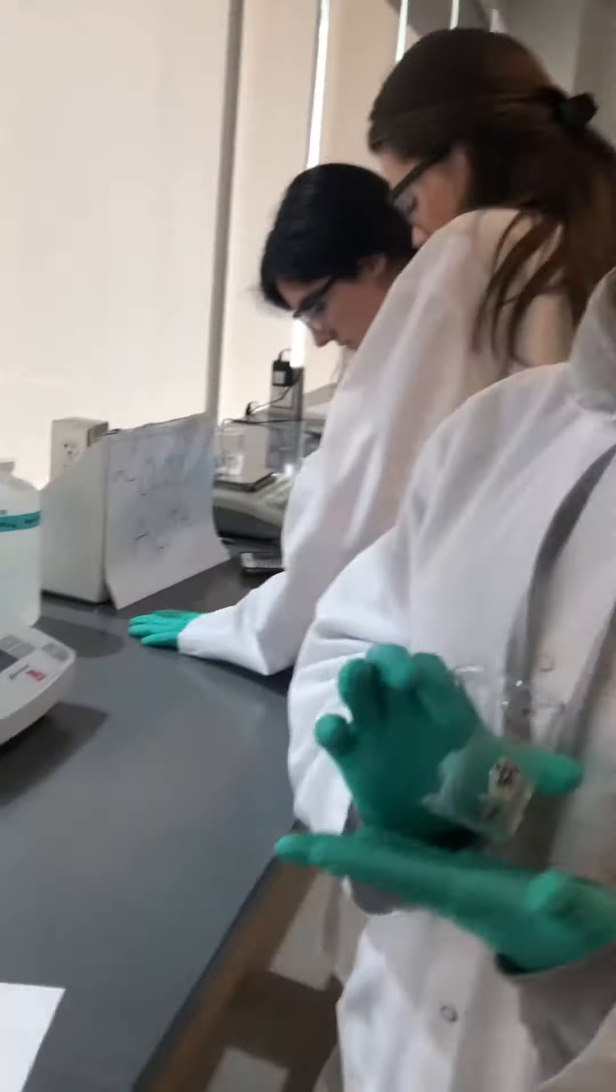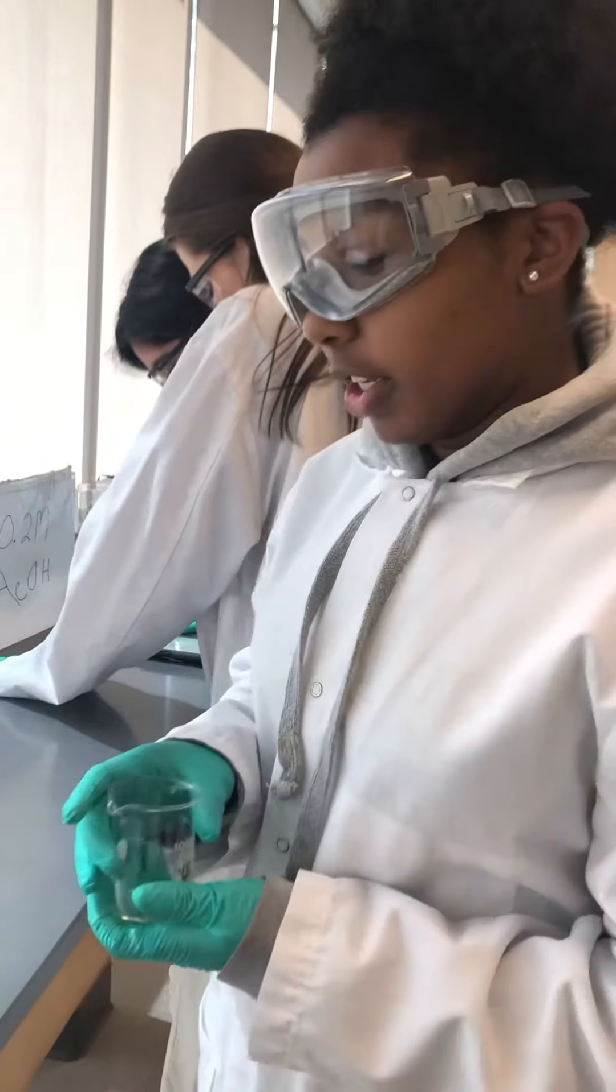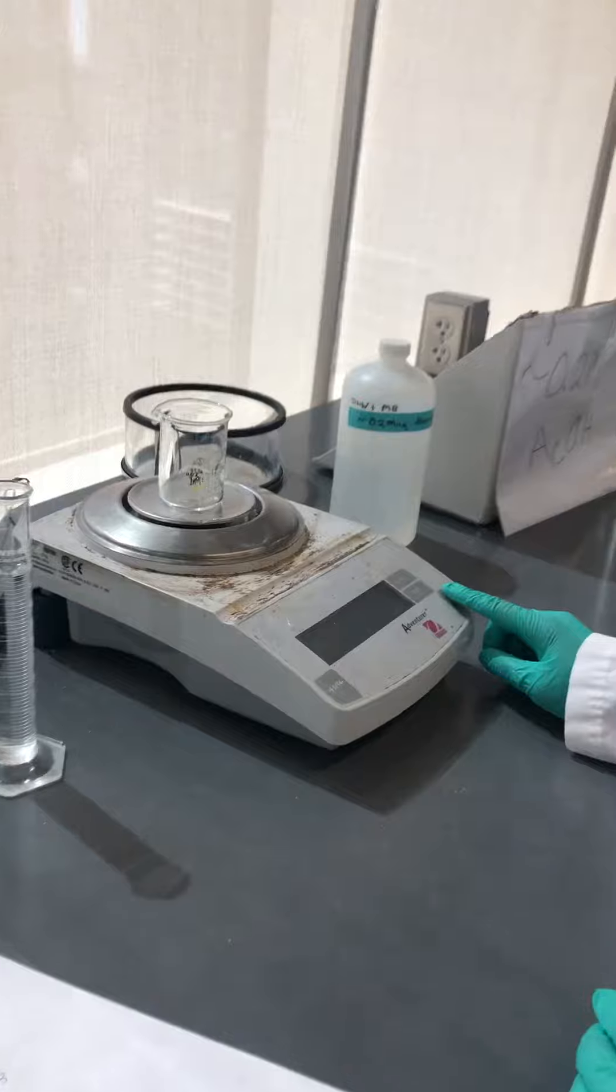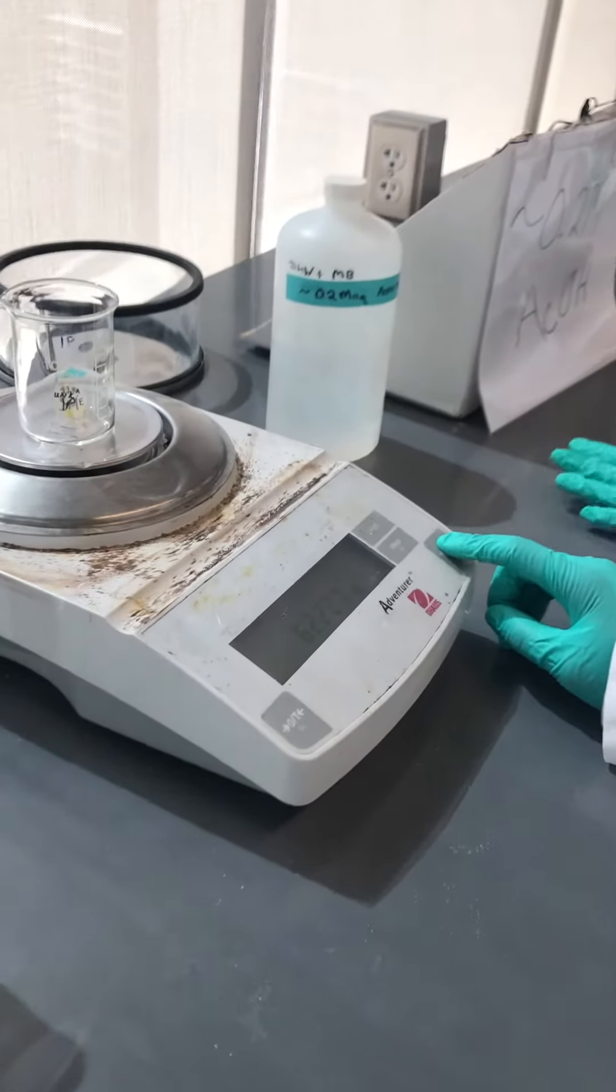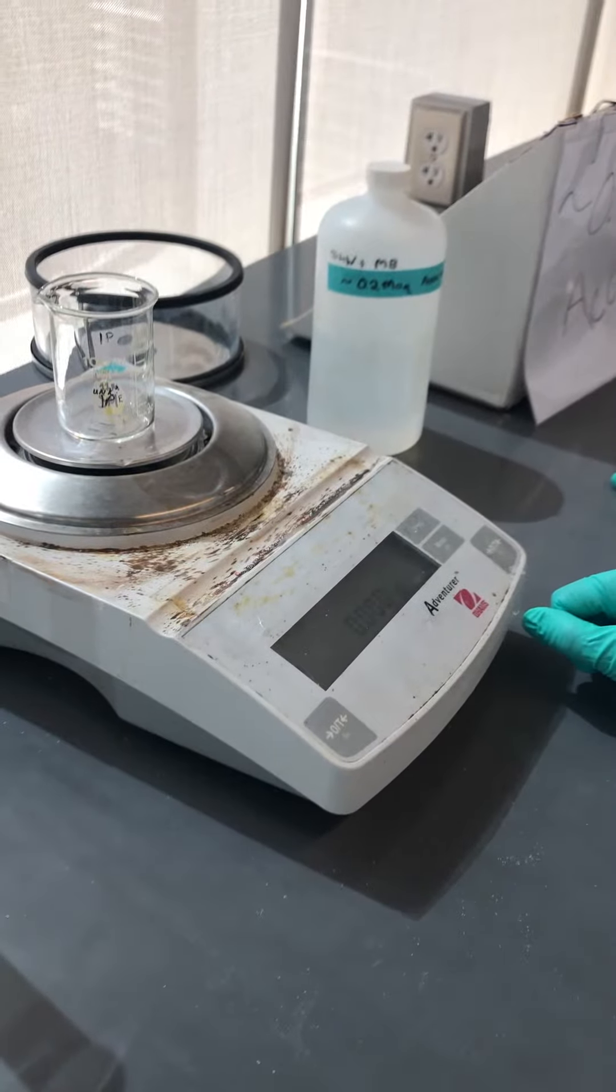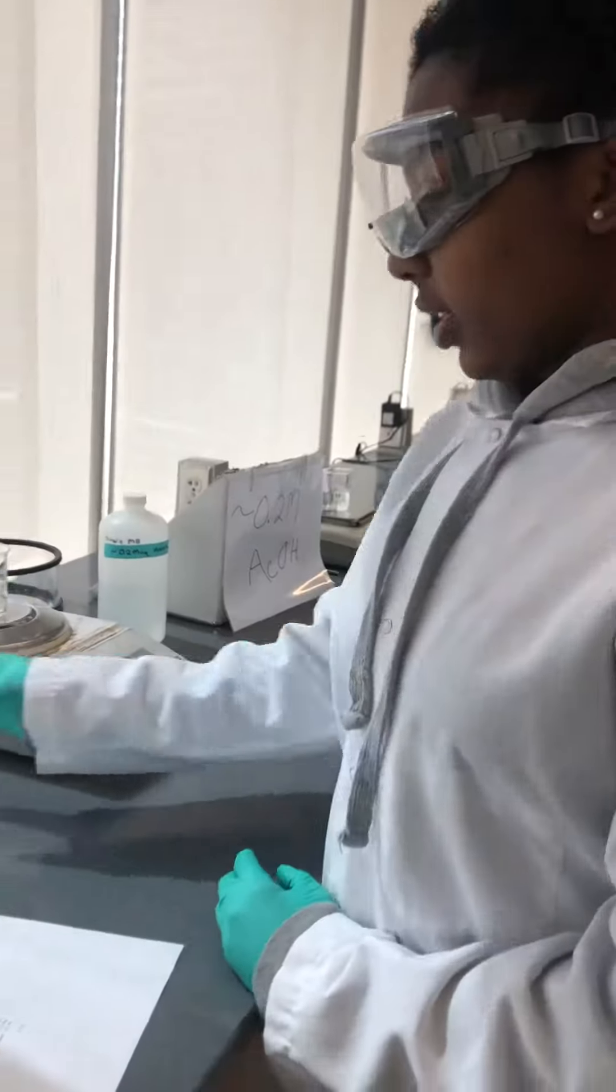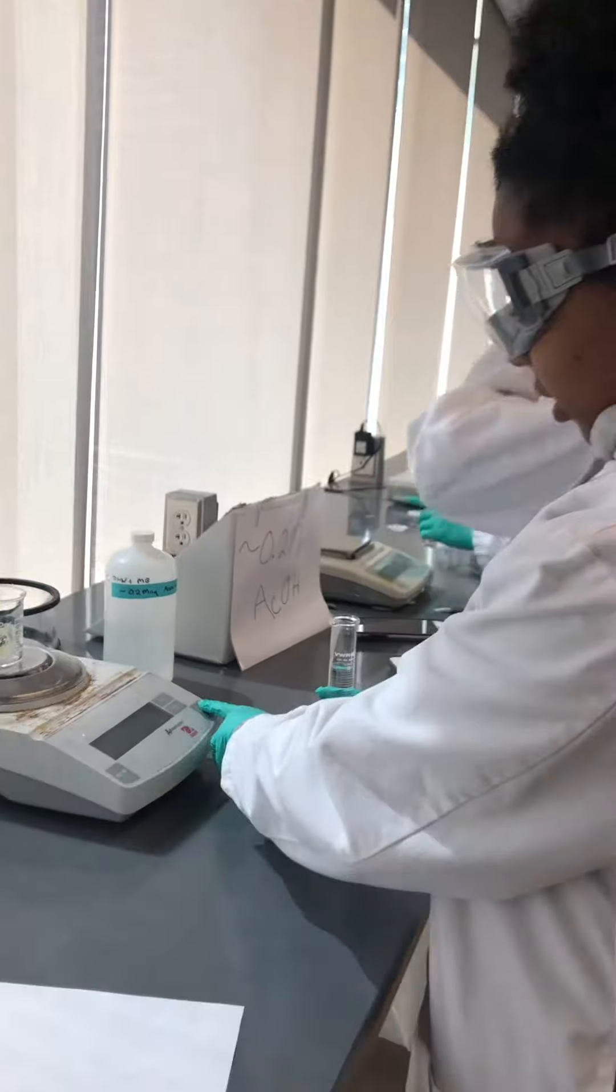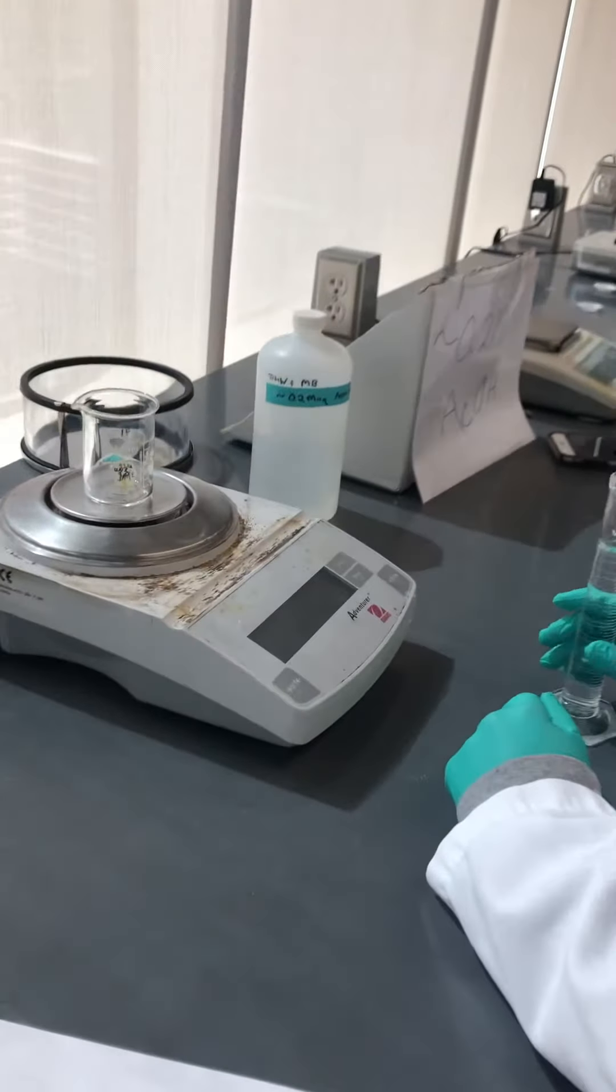So then we're going to put our empty beaker that we want to transfer the water into. We're also going to tare this, so that we can just add straight 50 and we'll get back the mass. Once it's tared, that's when you can add the water.